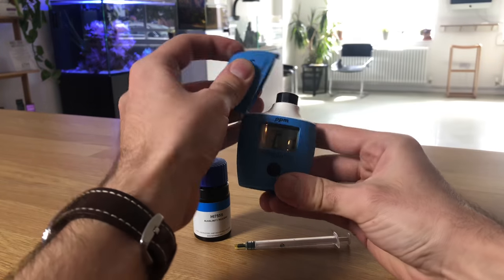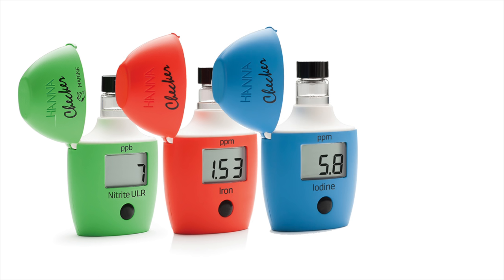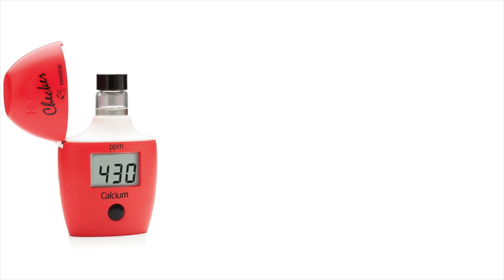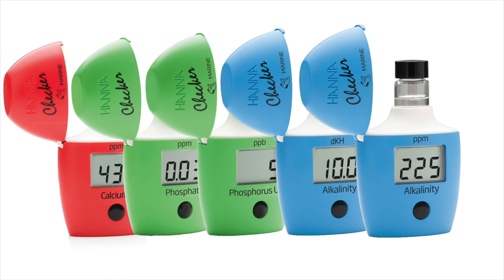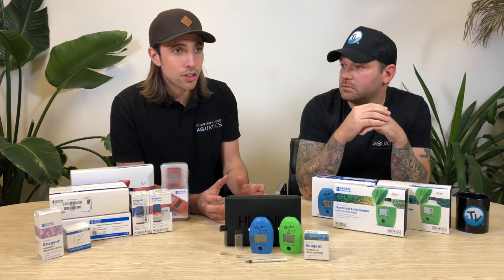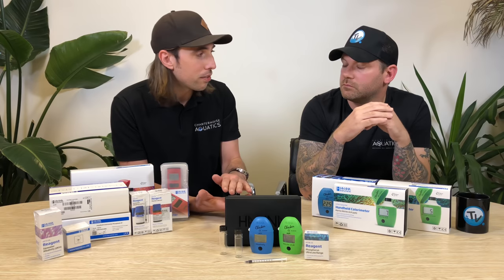There are checkers available for nitrite, for iron, for iodine, and even a checker for chlorine. But some of the best sellers include calcium checkers, the phosphate or phosphorus checkers, and the KH or DKH checker. With the phosphate and phosphorus and the DKH and KH, why do you have two for each one? In terms of the phosphate, it just depends on how accurate you want that reading to be at a low level in the aquarium.